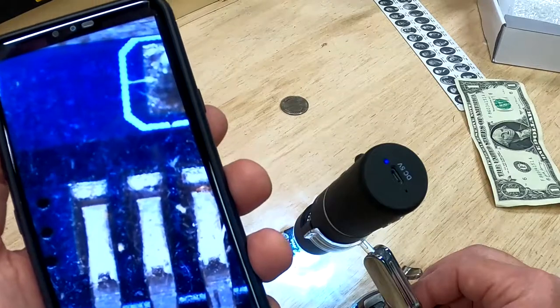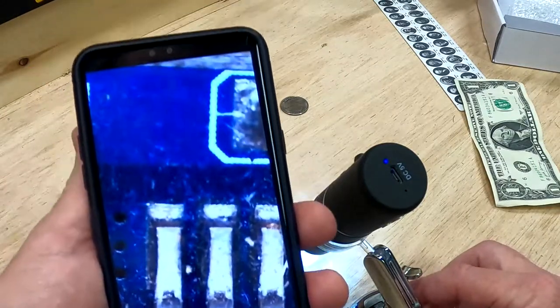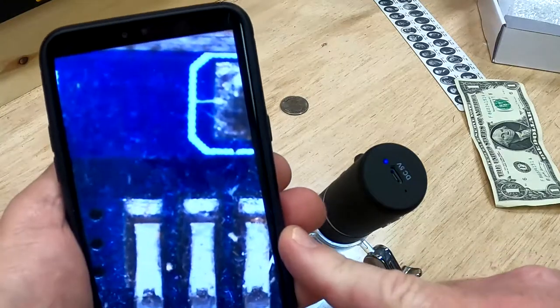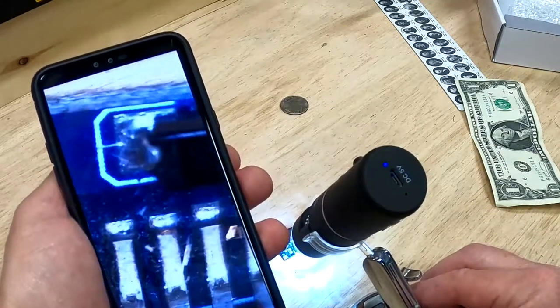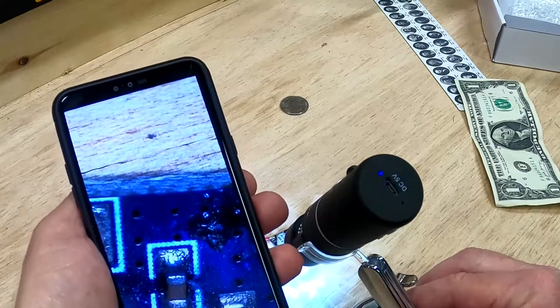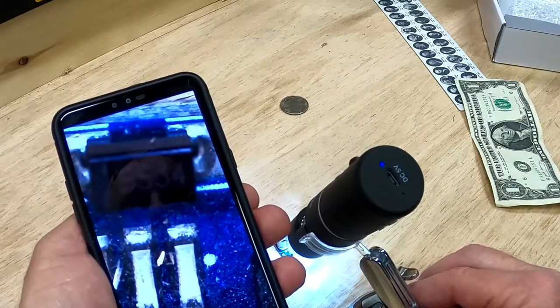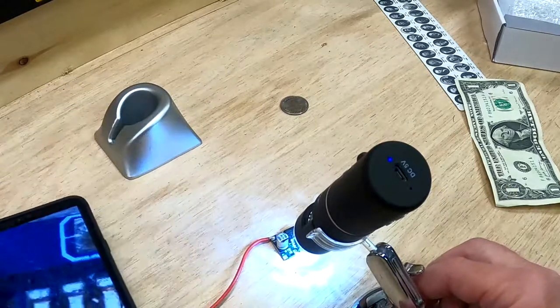You can do things like look in your own throat or at your own eye, and record on your phone while you do it. You can also hook it up to your computer — though to do that you'll need to disconnect your computer from your home Wi-Fi and connect it to the microscope's Wi-Fi instead. We're also going to repeat our bacteria project and use this to try to do a better job identifying all the bacteria — we found 15 different types last time but didn't get a good identification.